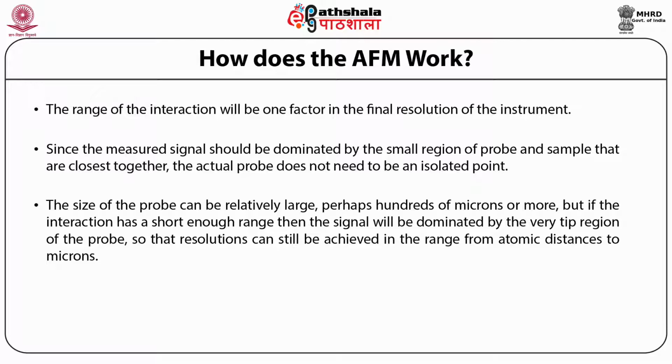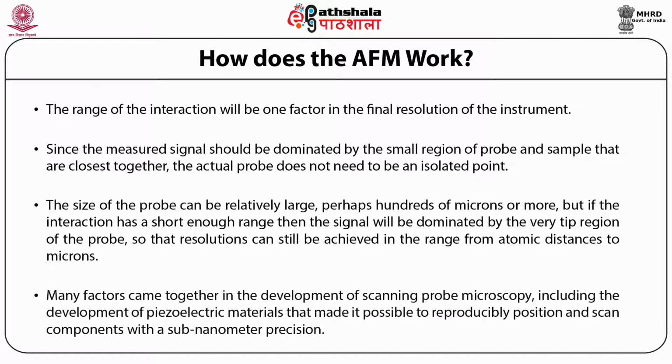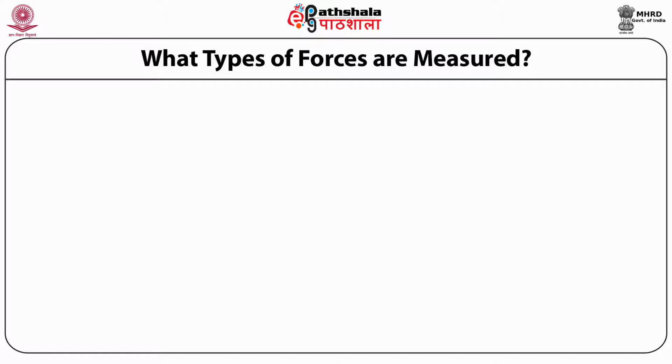The idea of a probe measuring a local interaction and building up an image is relatively straightforward, but the actual implementation of a system with a resolution in the nanometer range is technically challenging. Many factors came together in the development of scanning probe microscopy, including the development of piezoelectric materials that made it possible to reproducibly position and scan components with sub-nanometer precision. What type of force is measured?